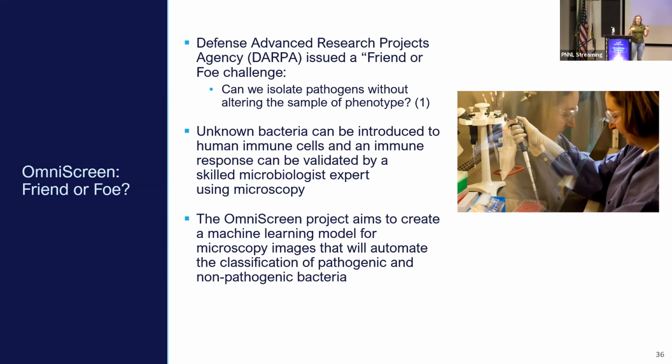I'm going to be going through their whole experimental design, but the end result that they were going to be testing and evaluating and actually using this model and this whole experimental design on is Arctic permafrost samples. Similar in complexity to a soil sample, but maybe even more unknown and more variable. And their goal was to start looking at, are there any unknown pathogens that are in the ice melt as the ice melts more?